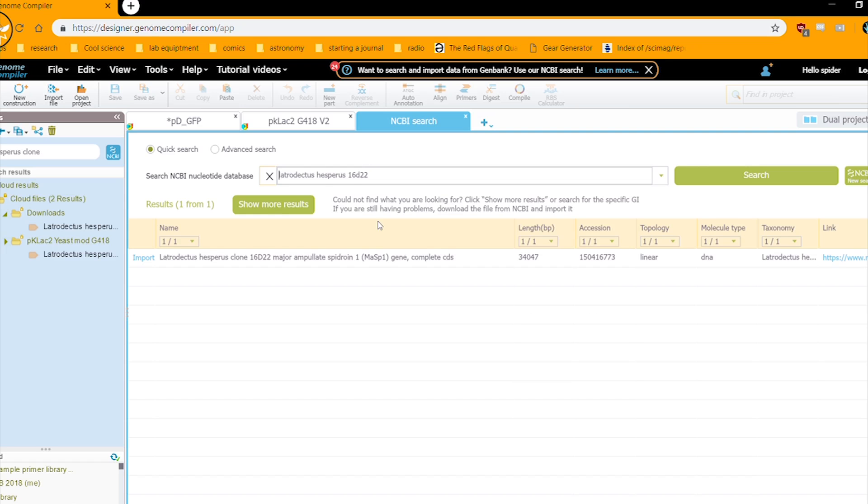Finally, before we get to doing our reactions we can do the same thing with our silk sequence, but instead of loading in the DNA from a file we look up the sequence in the NCBI database. In our case I had looked it up earlier so I know the name of the sequence to look up, but if you just know the name of the gene or protein you want you can search it here and see what shows up.